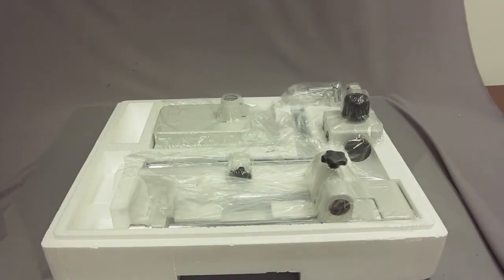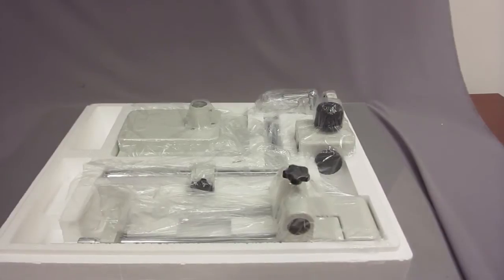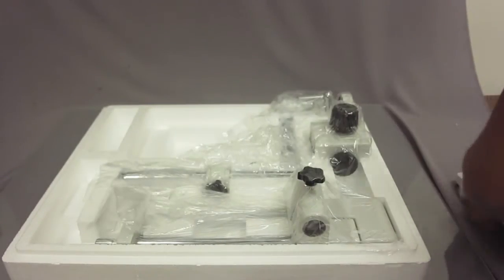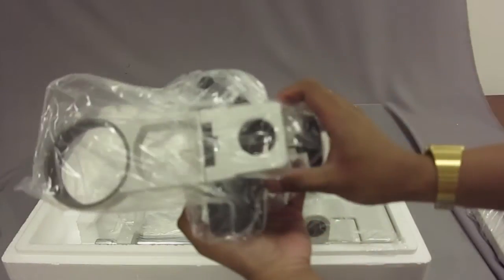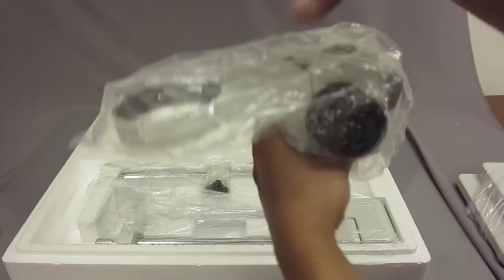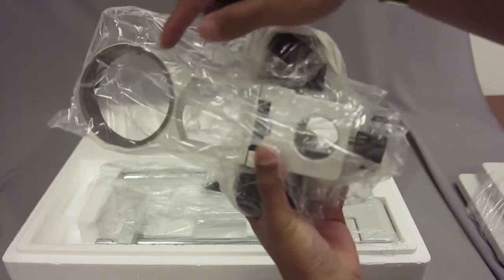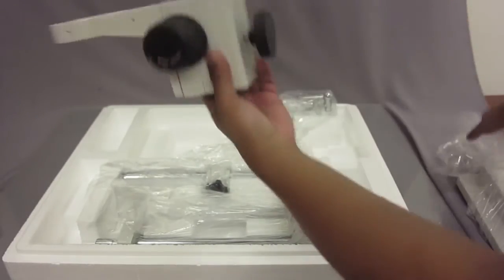There are a couple of parts in here. The heaviest part in this box is the base — this right here is the base of the stand. The other part is the focusing rack. The focusing rack is what you attach to the rest of the base so that it holds the head of your microscope. It comes to the standard ring of 76 millimeters. Here's the focusing rack.